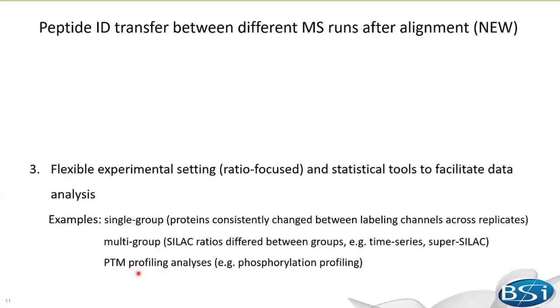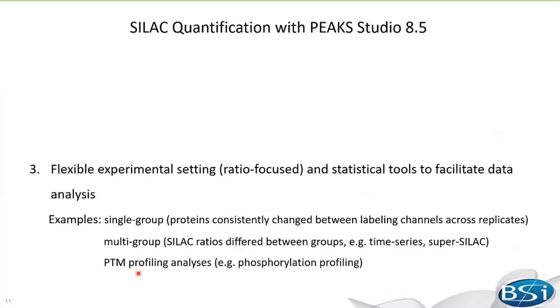I'm going to show three examples of how to use PICS Q to analyze complex SILAC data using published datasets. The first study identifies proteins showing consistent expression changes between labeling channels across replicates. The second study examines how SILAC ratios differ between multiple groups, such as a time-series profiling or super SILAC analysis. The third study focuses on PTM profiling analysis. Before these specific cases, I want to emphasize that in 8.5, the SILAC Q result is ratio focused.